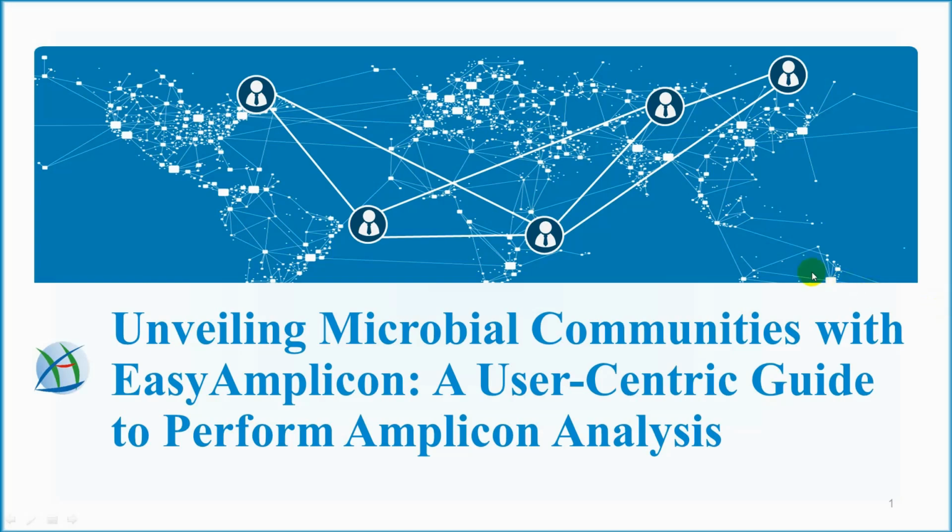Hello everybody, we are going to explain the unveiling of microbial communities with EasyAmplicon, which is a user-centric guide to perform Amplicon analysis. Advancement in high-throughput technology, data analysis methods, and bioinformatic tools over the past 2 decades have significantly contributed to our understanding of the microbiome, its crucial role in humans, plants, and animals, as well as interaction among them.